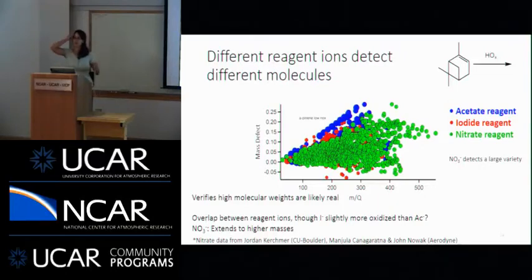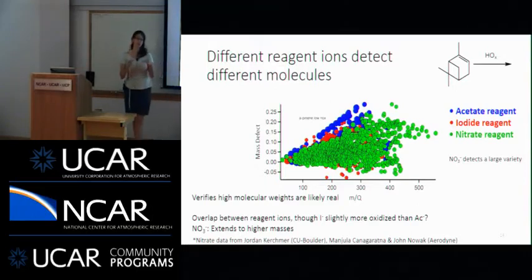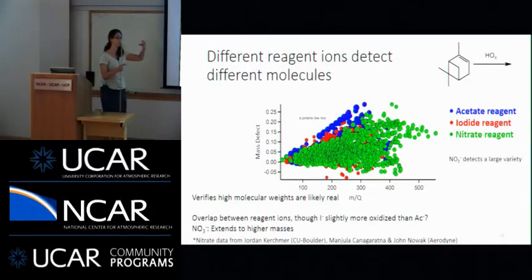Yes, question. You might get to this later, but I was wondering if you were assuming that each one is the molecular ion and you're not accounting for fragmentation. Yeah, so that's a really good question. The question is whether each of the dots on this figure, each ion, is a molecular ion, so the original molecule that was in the atmosphere, or if it was something that broke apart in the mass spectrometer.